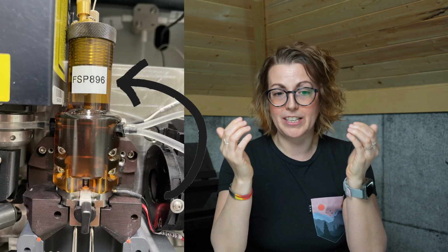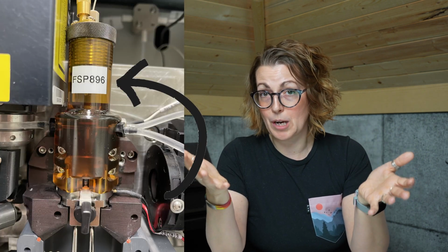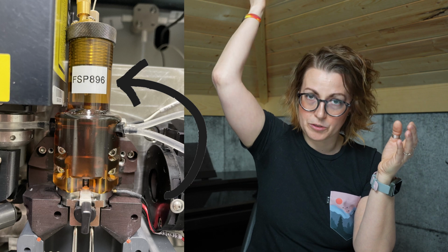Going back to the fluidics now, another major difference between analyzers and sorters is that the fluid stream in sorters is vibrated by a transducer. This is what makes it cause droplets. If it wasn't vibrated, your cells would just flow out in a solid stream. Adding that vibration to the stream makes those droplets form. This transducer will apply a known frequency and amplitude to the stream.